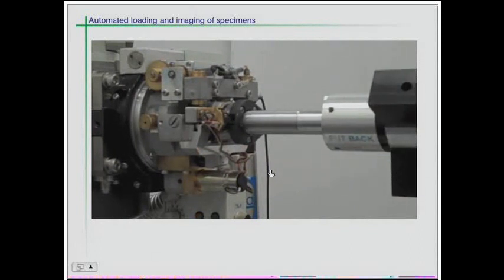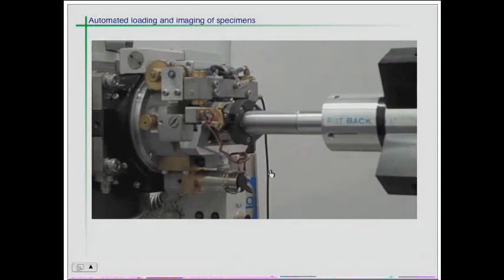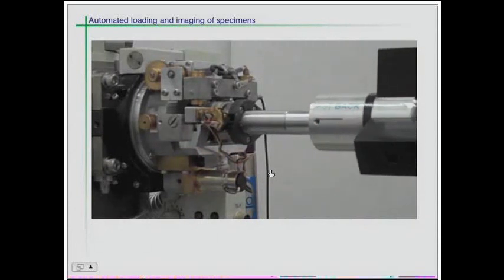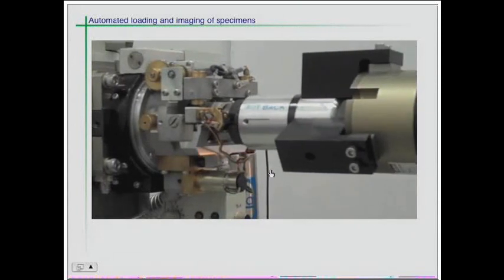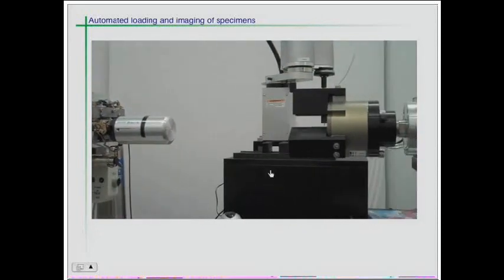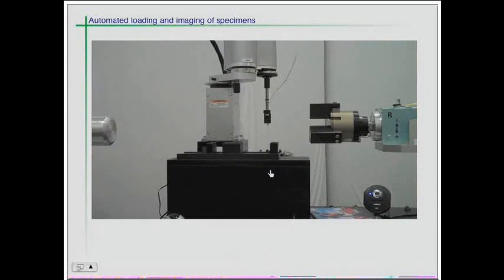So it has taken us about 1.5 years. The robot came into the lab about 1.5 years ago, and it has taken us 1.5 years to have it up and running and to solve all the bugs and all the problems, but now it's really running quite smoothly. With the imaging system that we have, to load and evaluate 25 grids, 25 grids at the moment, it takes us 18 hours. So we need almost close to 3 days to evaluate a full screen of 100 grids.